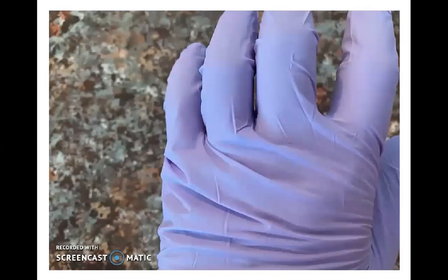And generally speaking, when you look at the back of your hand, which is what you're looking at in this picture, you should be able to move your fingers and your thumb around and not get these very large folds. You don't want the glove to have a lot of extra space. You want it to fit against your skin, but you don't want to wear a tight glove. It's not good. It will cut off your circulation.